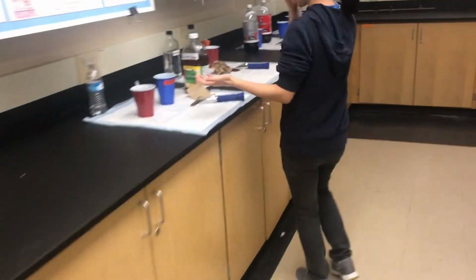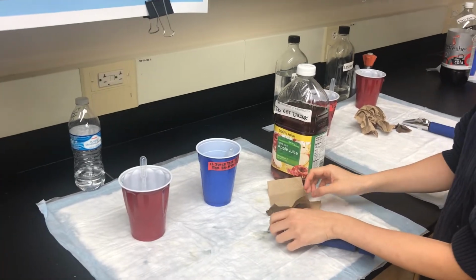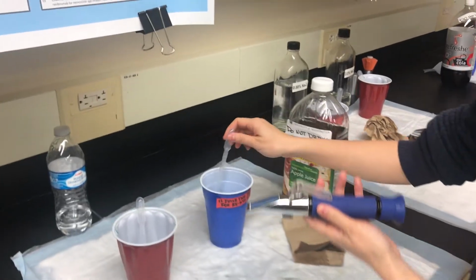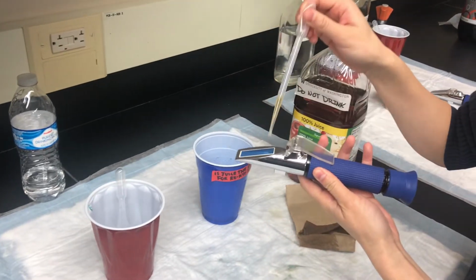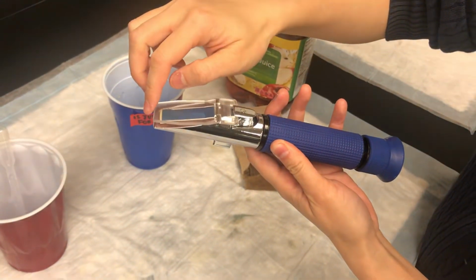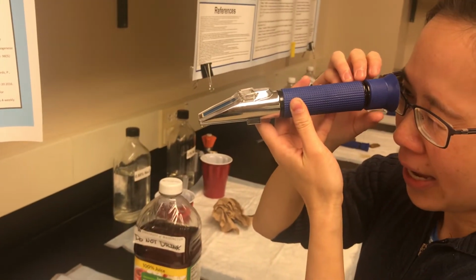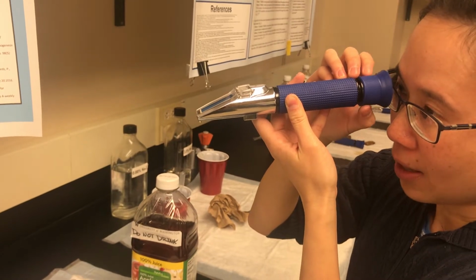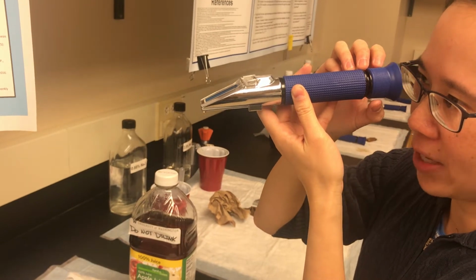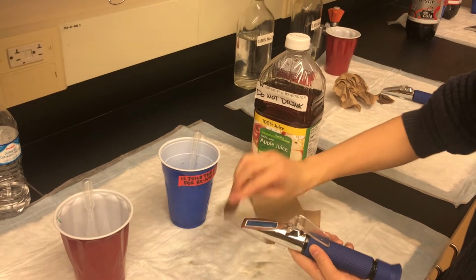Okay, so for this particular station, what you want to do is take a look in your lab manual and figure out how you want to hydrate. So this is a refractometer, and what I'm doing is wiping it off really carefully and then putting some apple juice onto the surface of the refractometer, okay? And now I'm closing it up, making sure there are no bubbles, and then looking straight through the refractometer, and it looks like for apple juice, the specific gravity is about 1.07, okay? So that's actually pretty high.